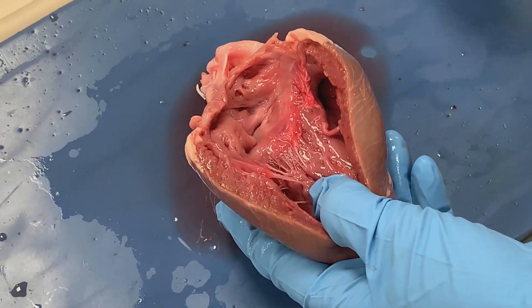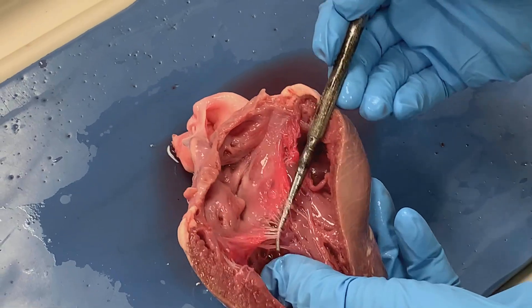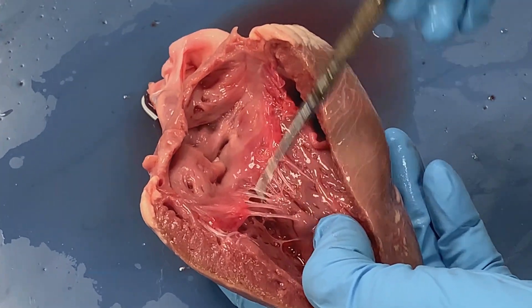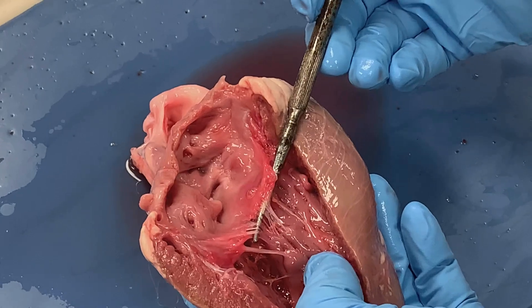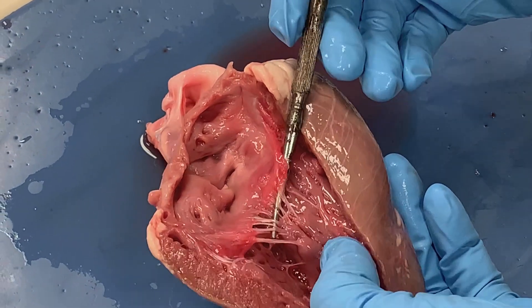What is also very interesting — we can see this flap-like structure that separates the right atrium from the right ventricle. We call this our right atrioventricular valve, also called the tricuspid valve.